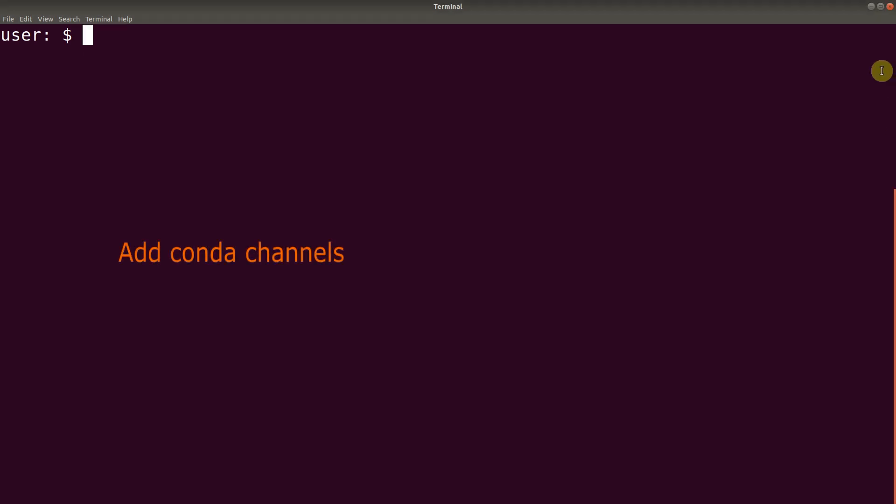So after you are done with the installation of the Anaconda Package Manager, you first need to add channels. So you add the channels by issuing these commands.